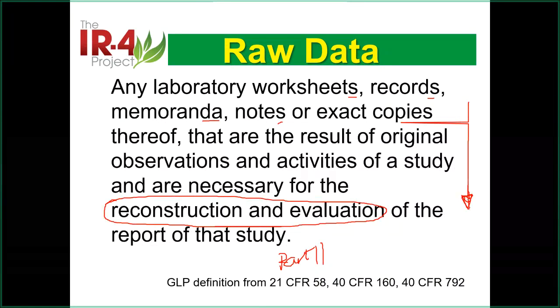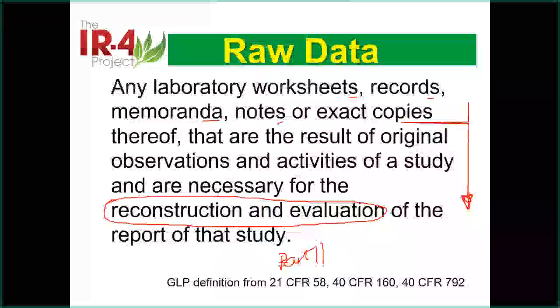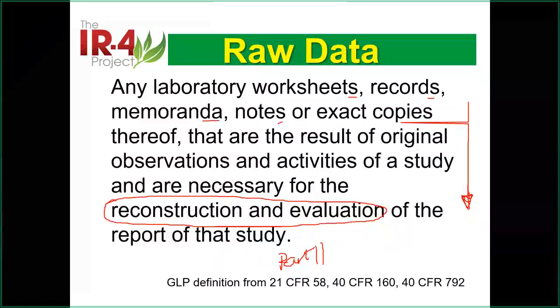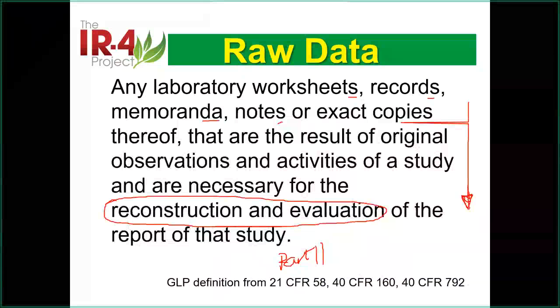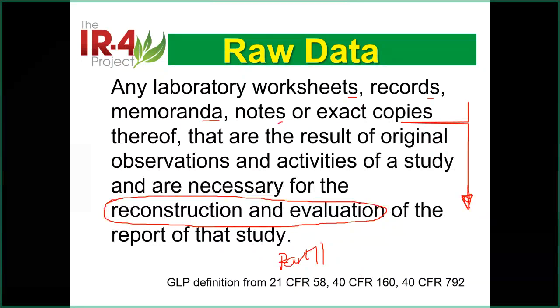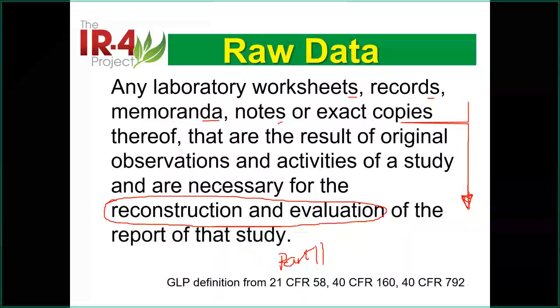However, it depends on your work. Sometimes it's very hard to validate this. It's not like paper. Paper is here. I can tell this is my signature. Okay, I wrote the data. I can prove that. But electronically, you need to have a lot of knowledge, the IT knowledge, and a lot of other things. I know there are a lot of IT people behind the scenes helping us with this training, and this is a big job. It's a lot of workload. How can you make this work? Plus, we do the GLP work. We need to validate. We need to verify what's going on.